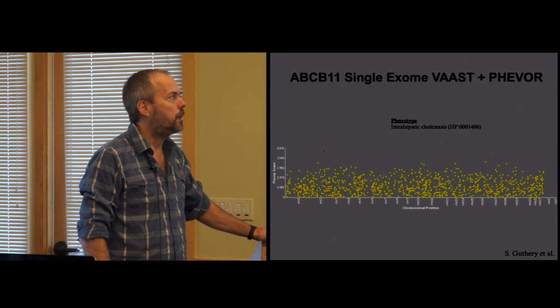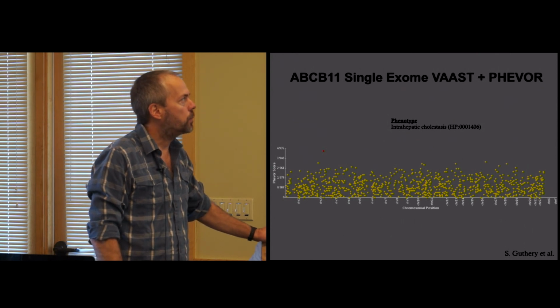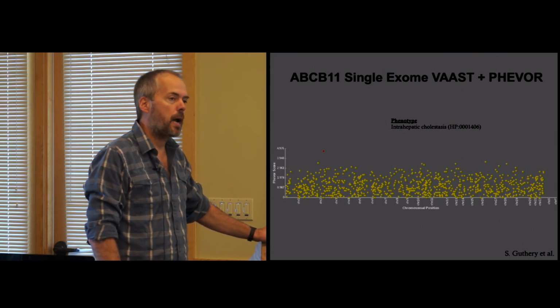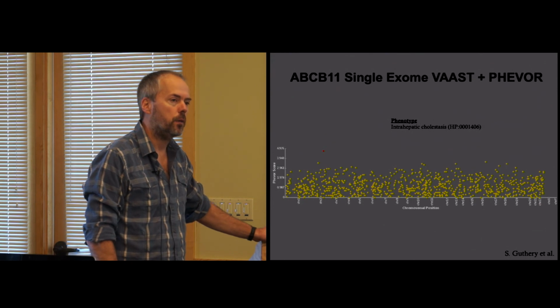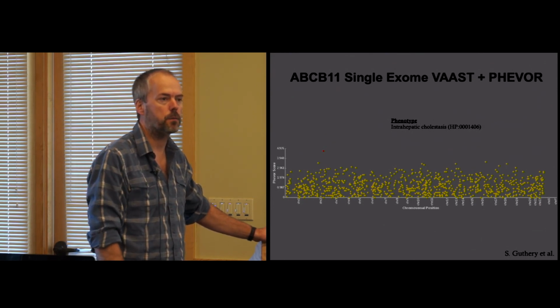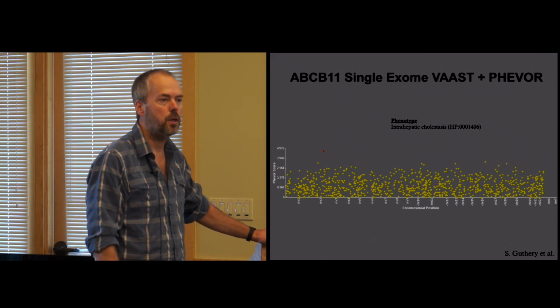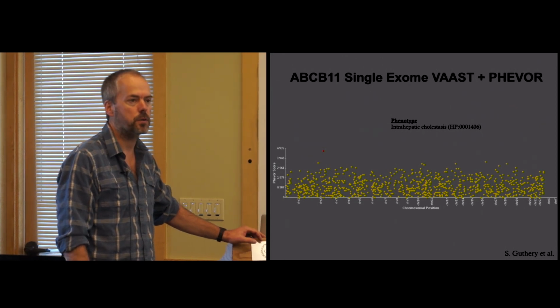So I think in general, the way we do it in practice is we'll go to the human phenotype ontology, for example, through the Phenomizer interface, if you're familiar with that. And you can just start typing in clinical features, and it will suggest terms in the ontology that those features have been associated with.